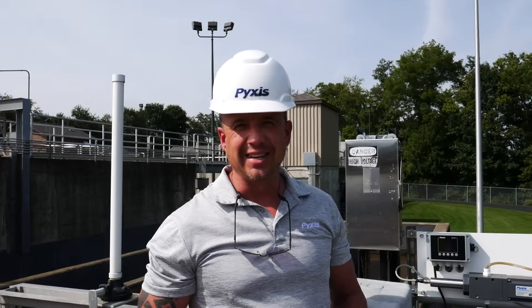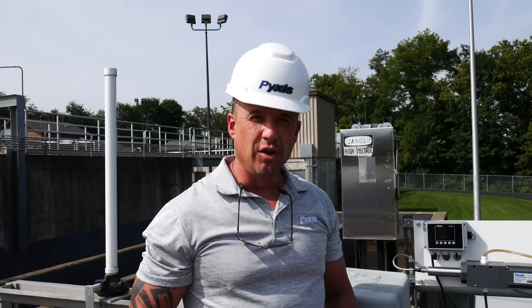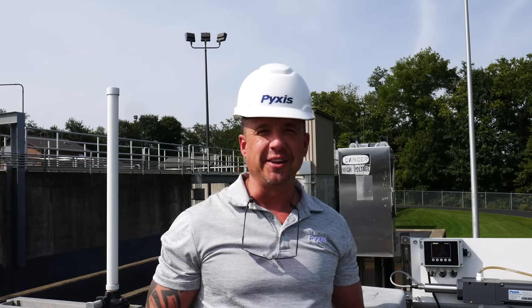Good afternoon everybody. This is Jeff Biak with Pyxis Lab. I'm actually out in the field today at a customer location that has a wastewater discharge application utilizing chlorine as the disinfectant.